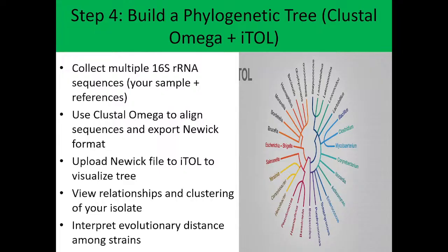into ITOL. And the meaning of ITOL, who can tell me the meaning of ITOL? ITOL means Interactive Tree of Life. To visualize the tree, that is what you will use. That one will help you to be able to see it very well. Then you'll be able to see different types of relationship, and you'll be able to cluster.